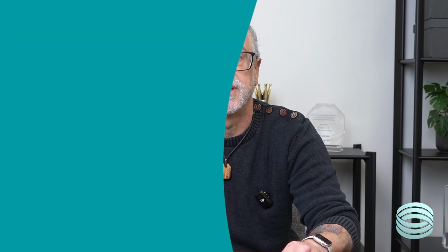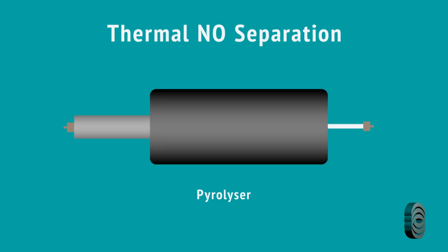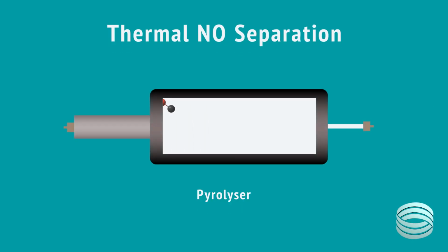Here's how it works. The TEA is used for nitrosamine analysis in two main ways, speciated and total. Each approach uses a different method to cleave the NO group from the nitrosamines. For speciated testing, a thermal method is typically used. A pyrolyzer is placed after the GC column, which applies heat to the analytes after they have eluted. This breaks apart the molecules and releases their NO groups, if present.